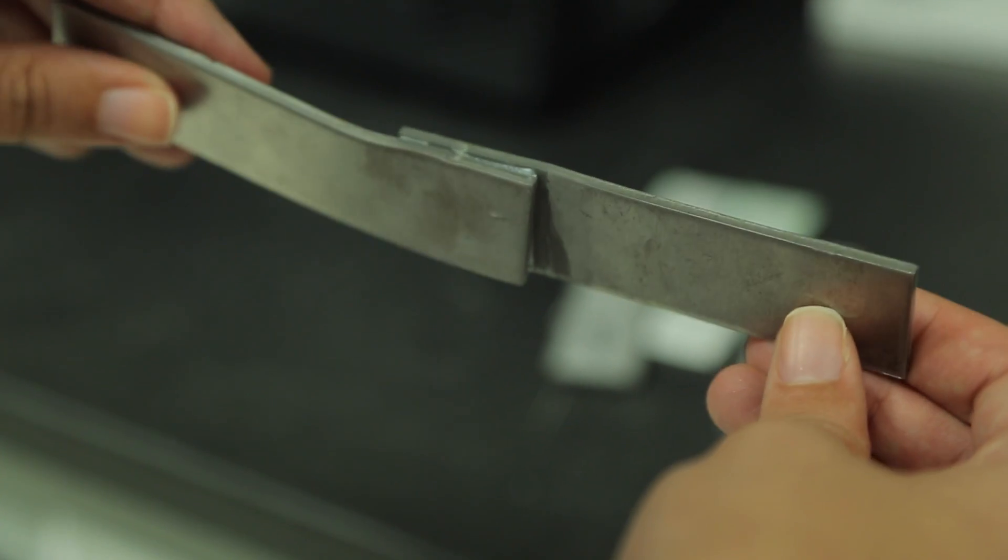Did you know that nowadays, adhesives which in the past had low peel and impact strengths can be toughened with elastomers, resulting in substantial improvement to these properties?